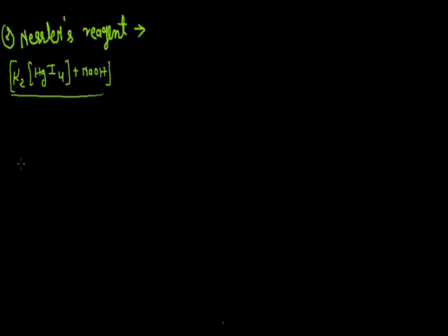So in this test, we are adding Nessler's reagent in the test tube.